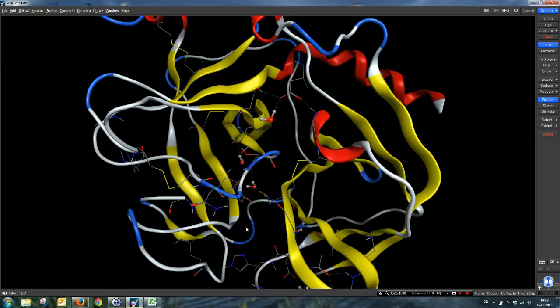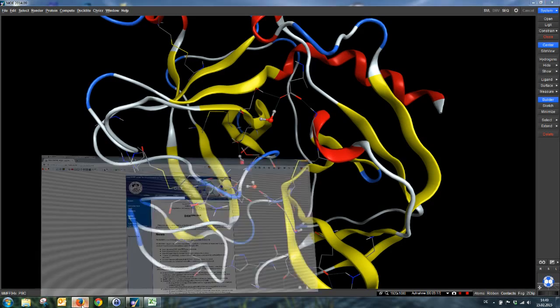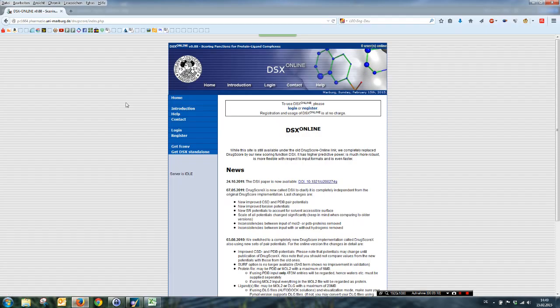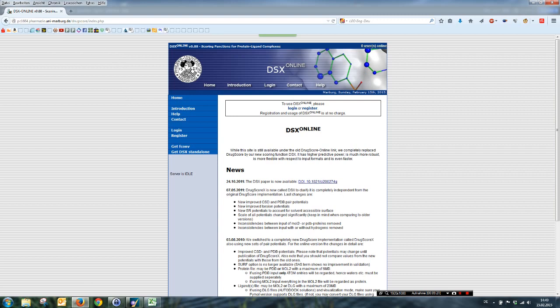Now there are two possibilities to use the DSX rescoring. One possibility is the web interface at this address here. You find it also in the Doctite manual, this address. And here you can register totally free of charge.